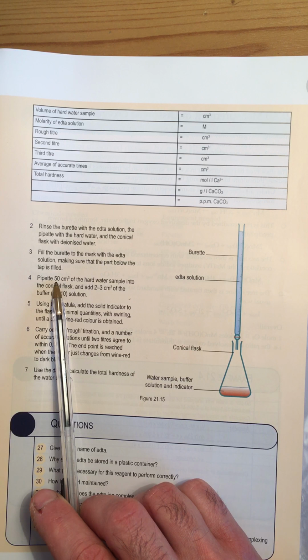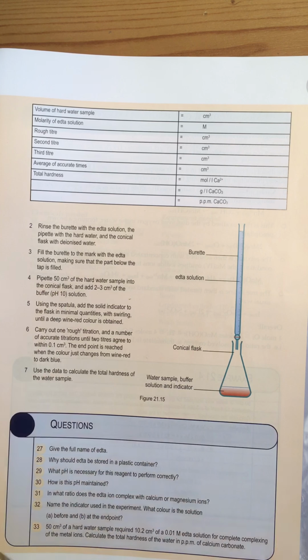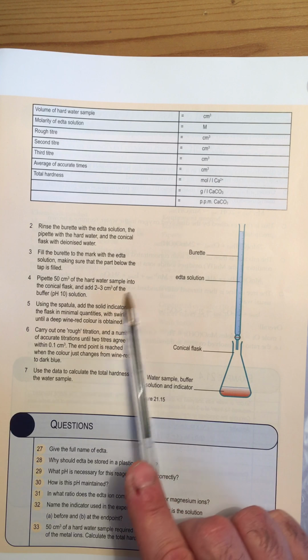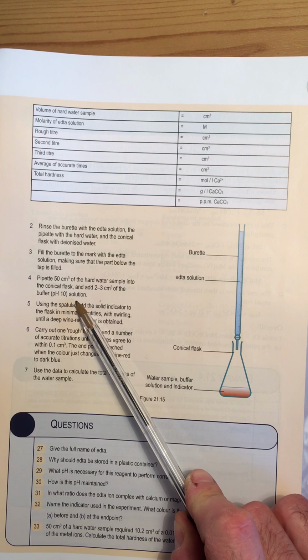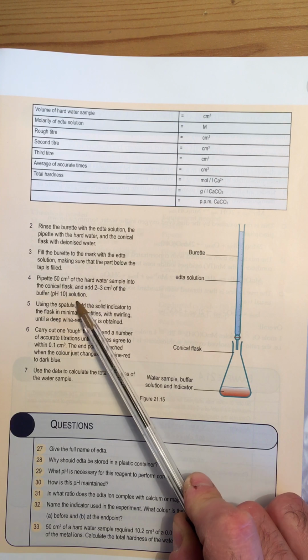That would be said in the question, but just out of habit, you might put in 25 as opposed to 50 when you're doing the calculation. So pipette 50 mils of the hard water sample into the conical flask. Add 2 to 3 mils of the buffer solution. That's important to keep the solution in the conical flask at above pH 9.